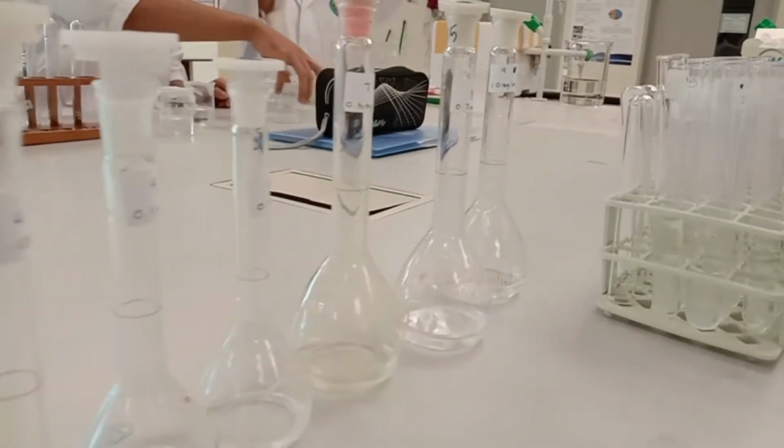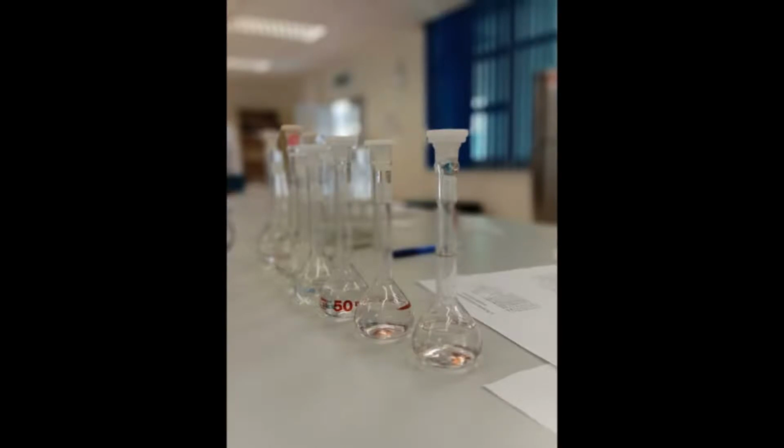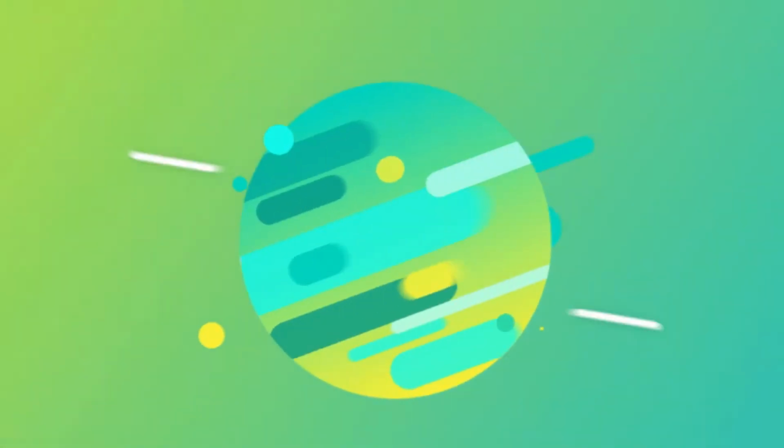In the standard reference, the starch solutions were prepared from a stock solution of 1.0 mg/ml into dilutions of 0.01, 0.025, 0.05, 0.1, 0.3, 0.5, 0.7 and 1.0 mg/ml. All dilutions were added with 1 ml of iodine and each was prepared to 50 ml. Absorbance of each dilution was measured at 590 nanometers.